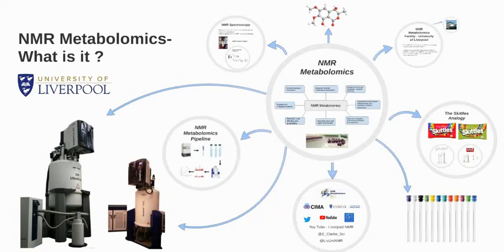NMR metabolomics. What is it? Today we are going to take a look at this high throughput analytical technique and give an overview of its applications and how it actually works. So without further ado, let's get stuck in.